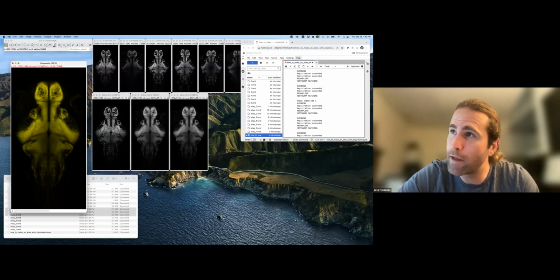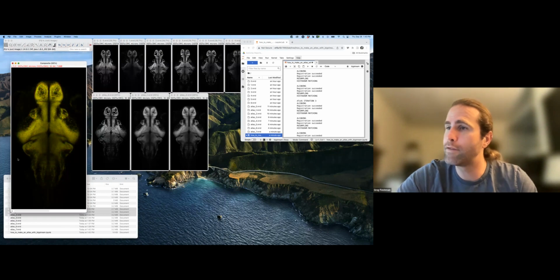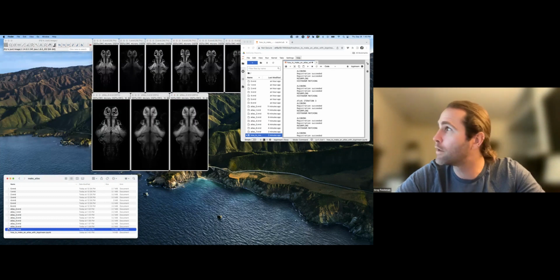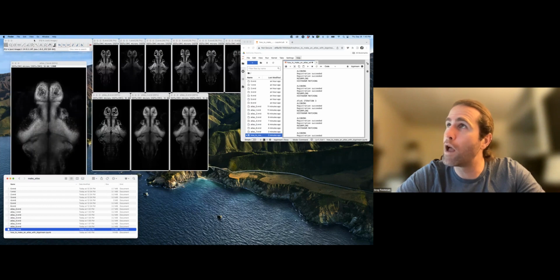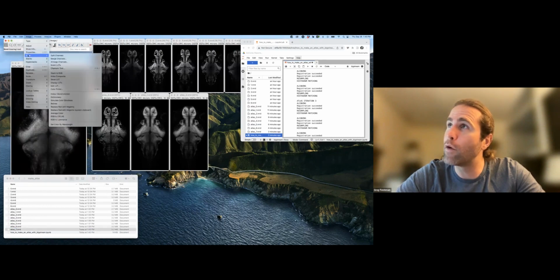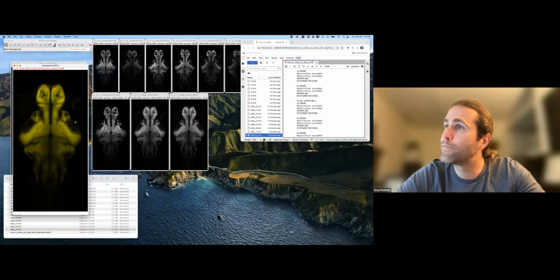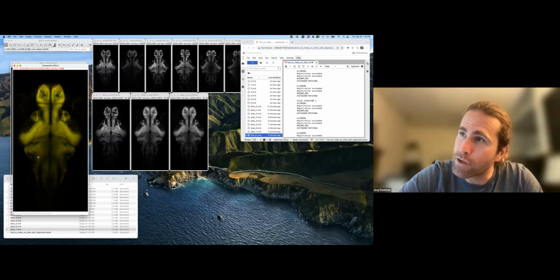But there is still some wiggling around a little bit of the boundaries. And the same thing will be true for the rest of these. So let me just pull out the last one. I think that should be the last one, Atlas 7, and compare that to Atlas 1. And we'll see what we gained from the final 7 iterations of the algorithm over just the first iteration. So not that much, a little bit of motion at the large boundaries.